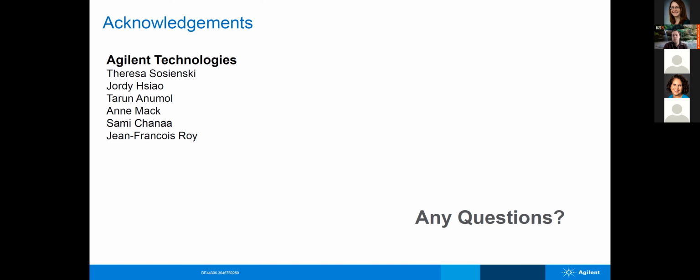I forget what the back pressure limit of that system is. The 6430 shouldn't really have an issue. I just sometimes worry about the older model LC back pressures. But if you want to shoot me an email, I will type it in the comments and we could take this offline and I could figure that out for you.